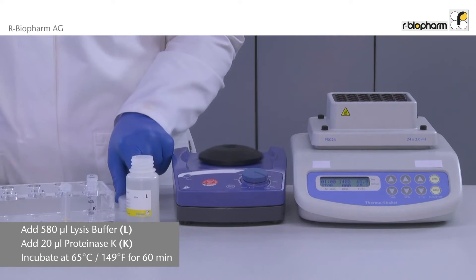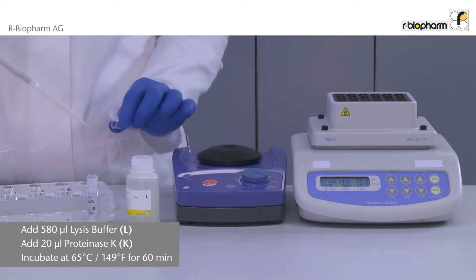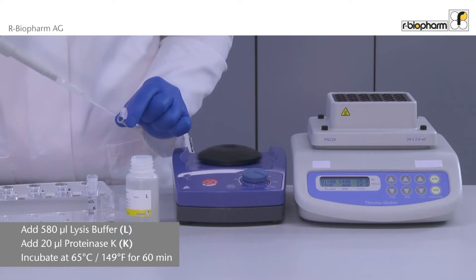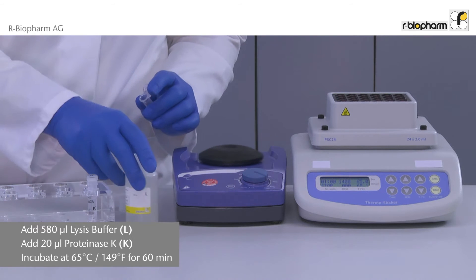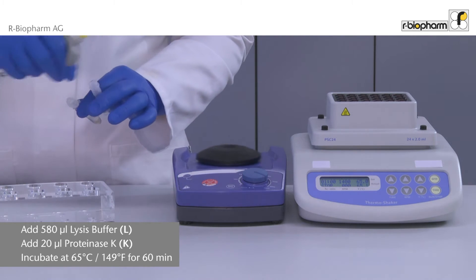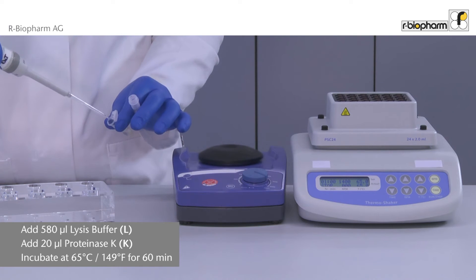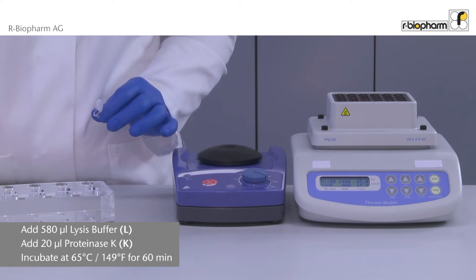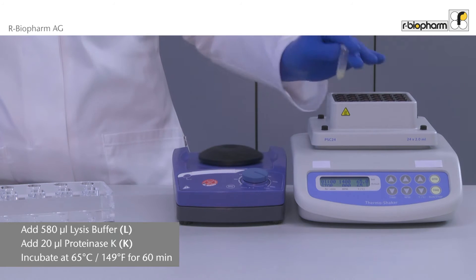Now we start with the DNA extraction. Add 580 microliters lysis buffer and 20 microliters proteinase K to the sample. Then the sample is put into a thermal shaker and incubated at 65 degrees centigrade for one hour.